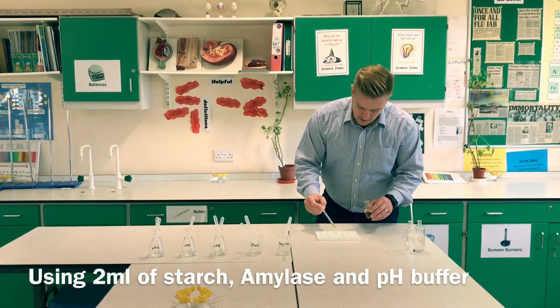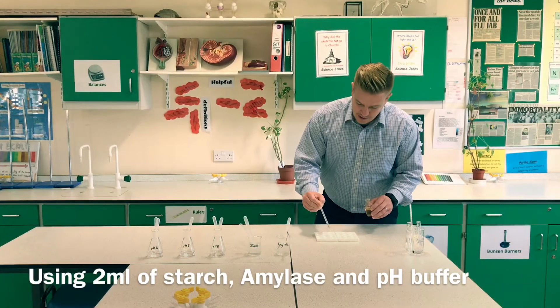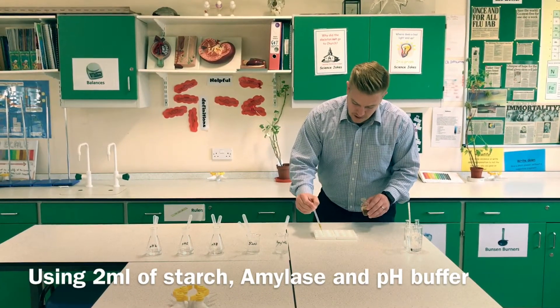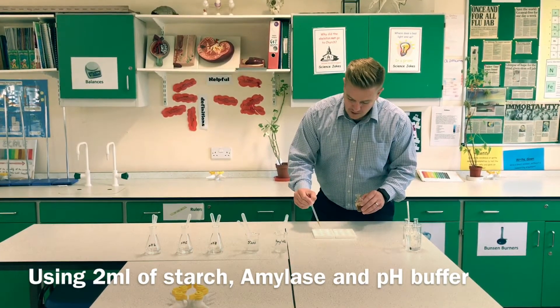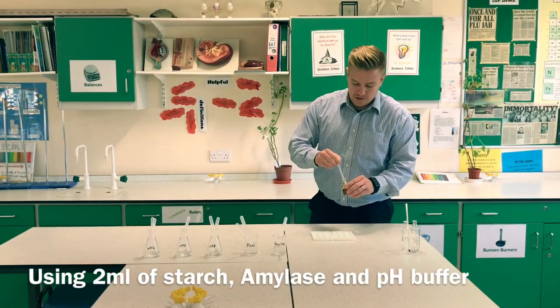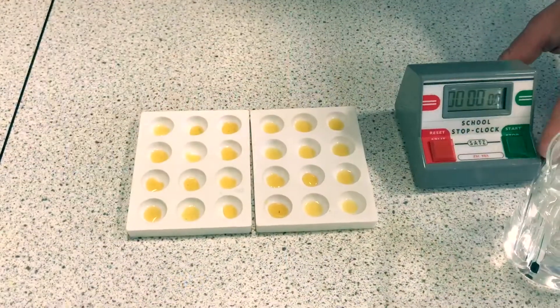Iodine will show up if there is any starch. The idea of this experiment is to show whether the starch has been digested over a given amount of time, depending on the variable of what pH has been used.